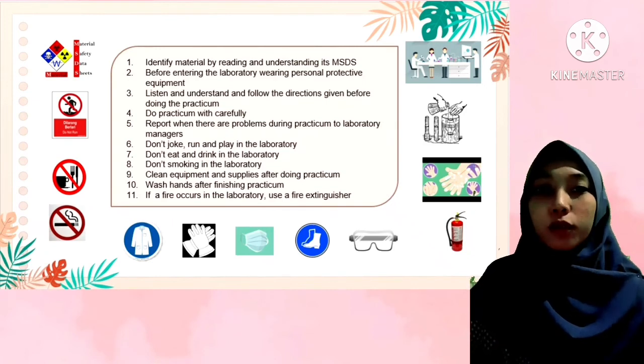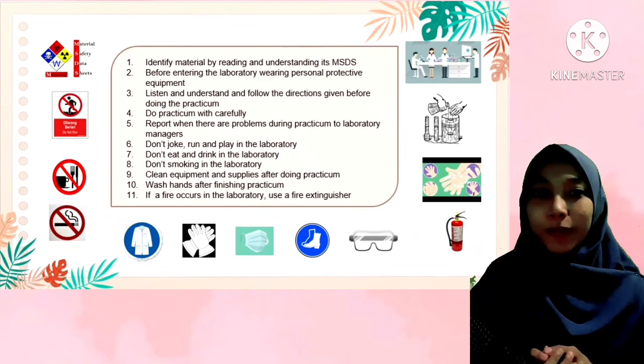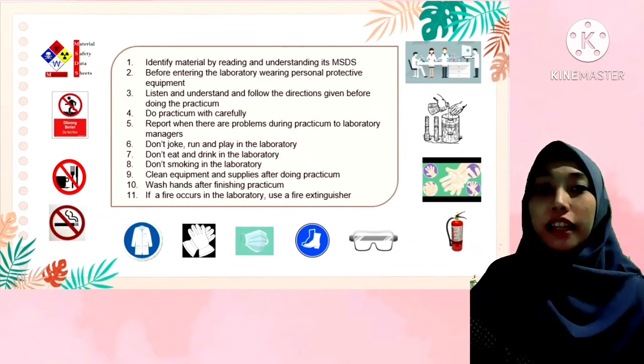Clean equipment and supplies after doing the practicum. Wash hands after finishing the practicum. If a fire occurs in the laboratory, use a fire extinguisher.